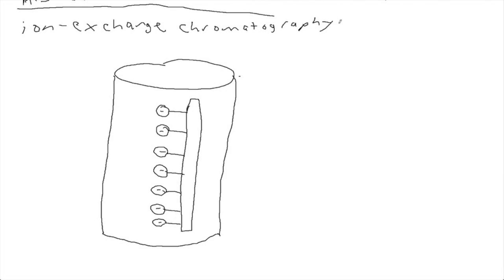So this is, again, a type of column chromatography, like gel filtration. Again, the sample is added at the top. I think that usually in this type of chromatography, some of the sample gets through and some of the sample is just permanently stuck inside. So which parts of the sample would elute at the bottom?